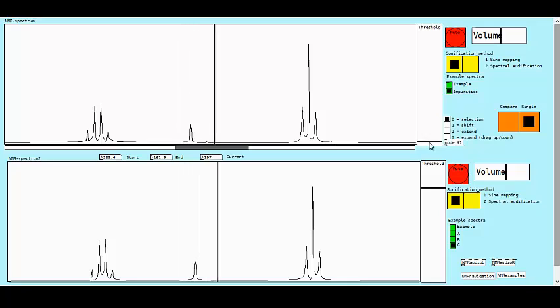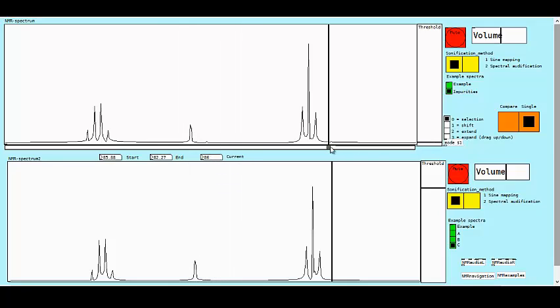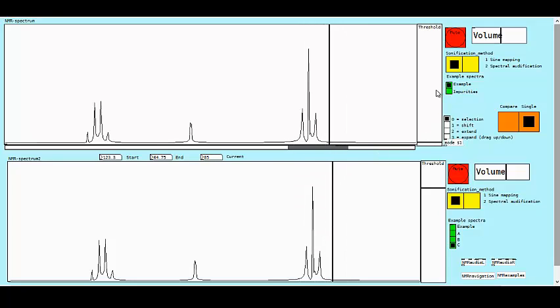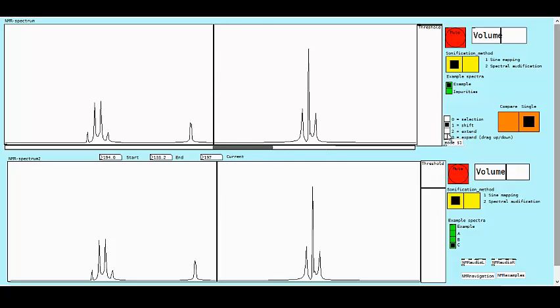you can start to really hear the impurities, so that they become a lot easier to find using this method. We also have variable volumes here and mute buttons for each one. You can also change the way that we select using these different modes. We can shift, extend, and expand.